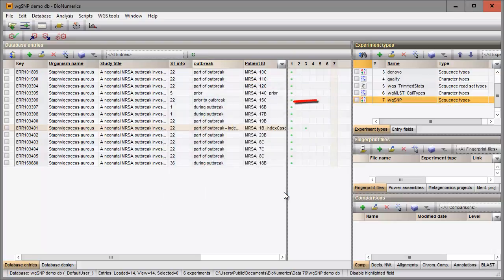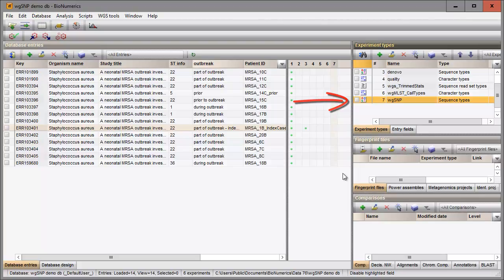The experiment is added to the experiment types panel. A reference sequence might be a fully annotated genome sequence, for example downloaded from an online repository, but could just as well be a de novo assembled sequence consisting of multiple contigs.